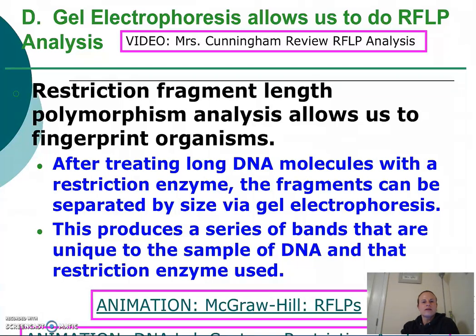Hi guys, Miss Francis here to talk about another DNA technology called gel electrophoresis, which allows us to do something called RFLP analysis. RFLP stands for Restriction Fragment Length Polymorphism.